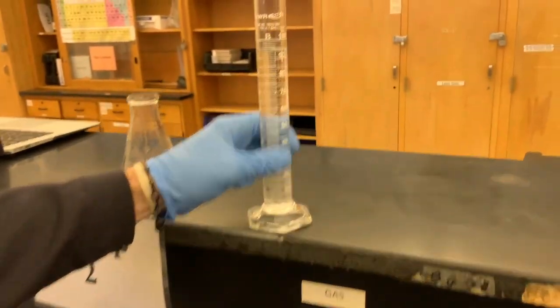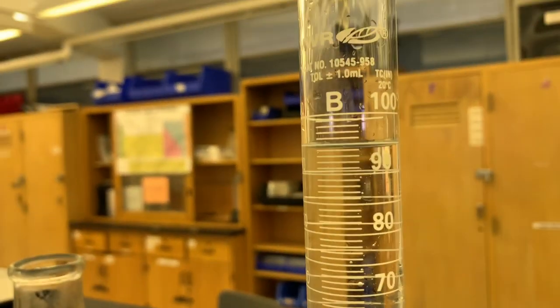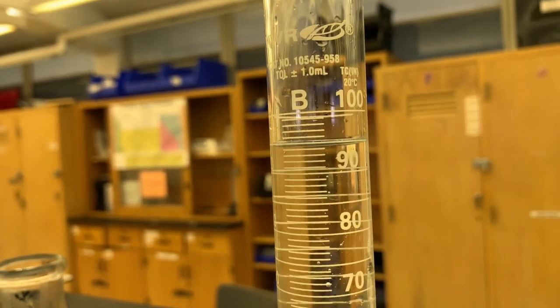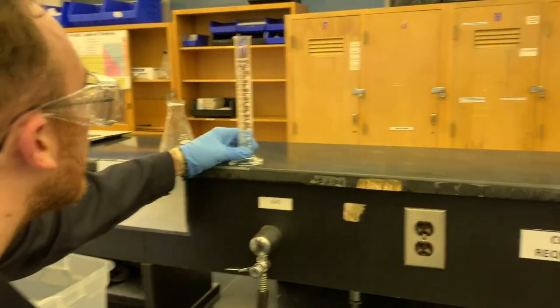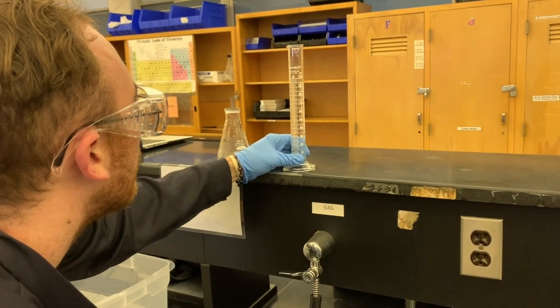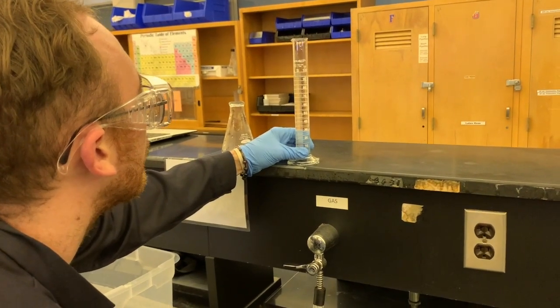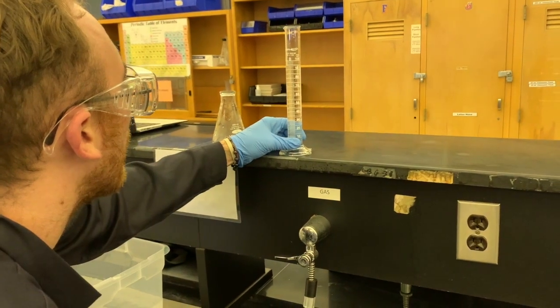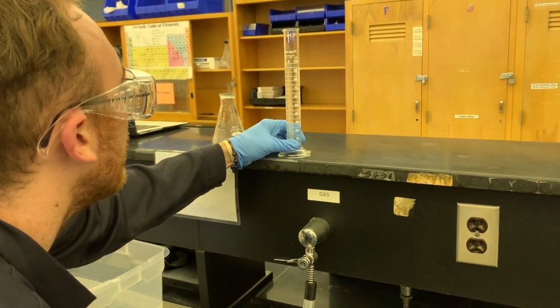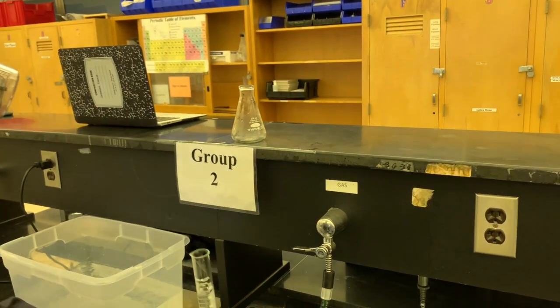So, the big difference in temperature here caused us to withdraw about 94.3 milliliters. So write that down.